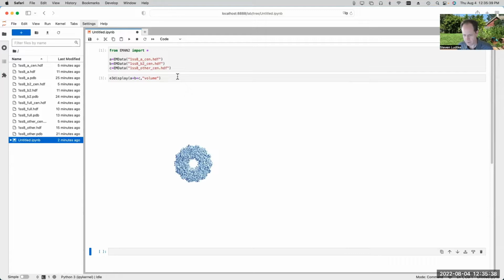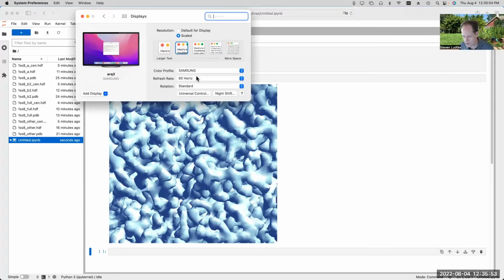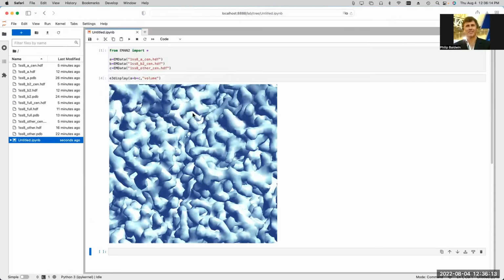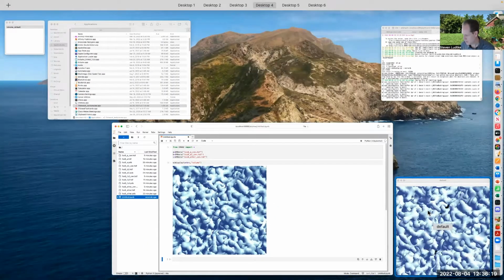So we can easily add or subtract different pieces as we like. Sorry, again, we've got the display resolution thing that I talked about last time, where I'm using a high resolution display setting. I can adjust that again. I need to use a low resolution 1080p mode if I wanted to scale properly. I thought we did something to fix that. Maybe I still haven't updated. We'll do that. Now, try it again. Oh, hang on. Oh, changed here too.